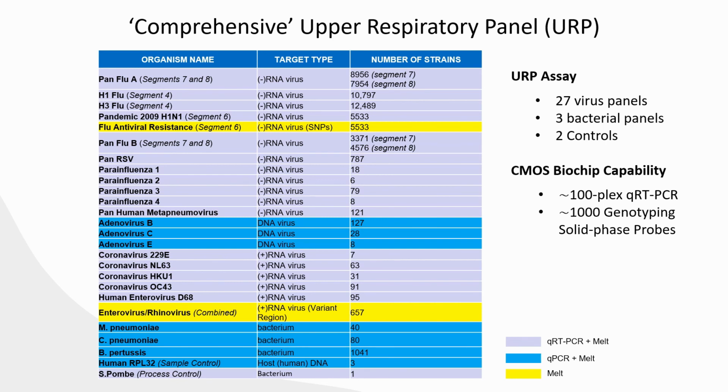Although our panel, our biochip and the Hydra system, was highly multiplex, dealing with this inclusivity and exclusivity and designing primers that are that general, working in a single channel without interfering with each other, was a true challenge.